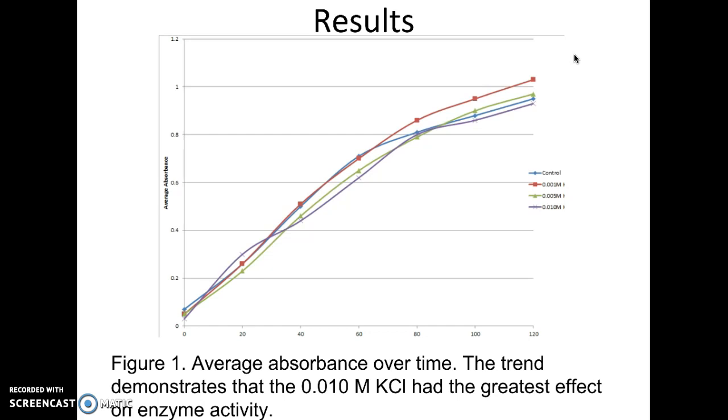This is not a big deal because the positive control data was used in comparison to the data from the other 3 treatments. There was no significant difference in the absorbance of all treatments and positive control between time 0 seconds and 100 seconds. In the last 20 seconds, there was a visible difference between all of the treatments and positive control.